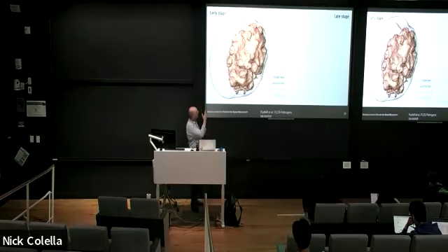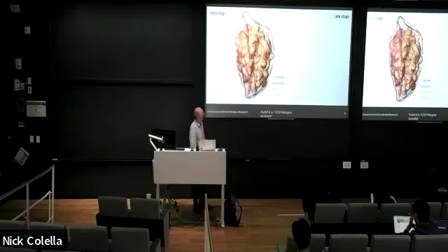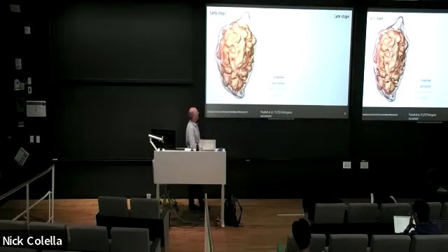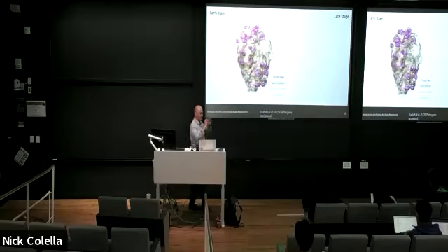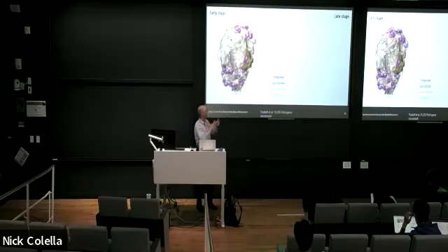These are 2 volumes. As you get at the end, once you have taken the series of hundreds or thousands of images, you segment these images into the different compartments that the cell has. And then you see here, for example, we can nicely see the early stage. You can see here the outer membrane, how it starts to work inwards.